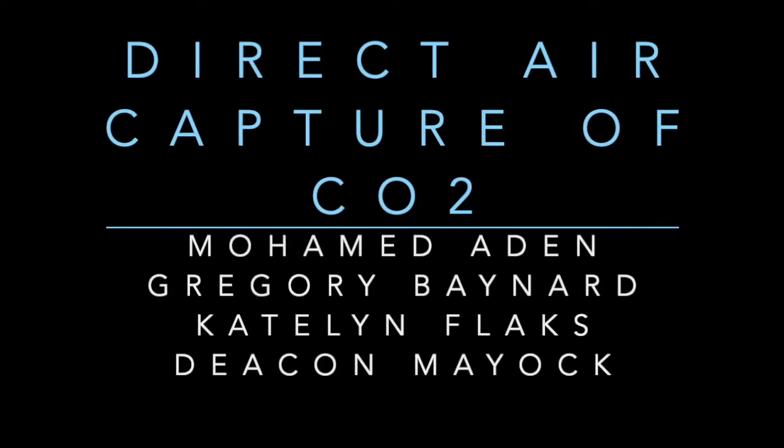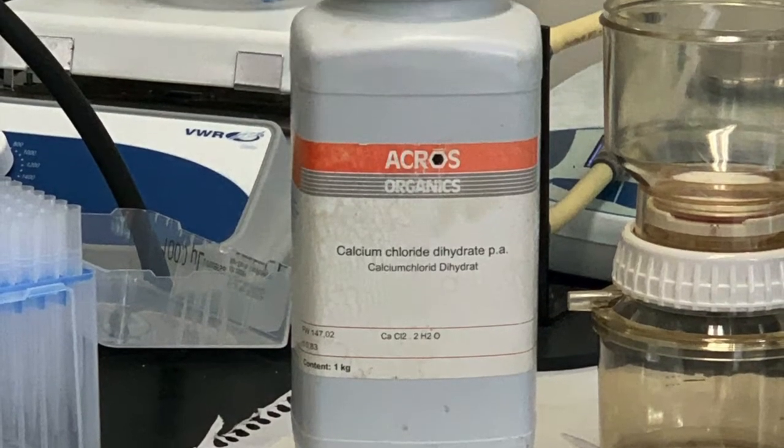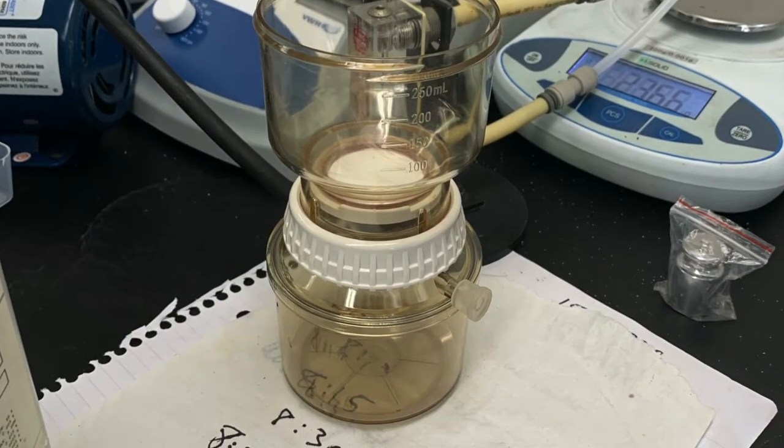For this lab, we looked at direct air capture of carbon dioxide by reacting it with calcium chloride in water to form calcium carbonate. Our plan was to measure the mass of solid produced at different pH values over time to find how the rate of carbon dioxide removal changes with pH.